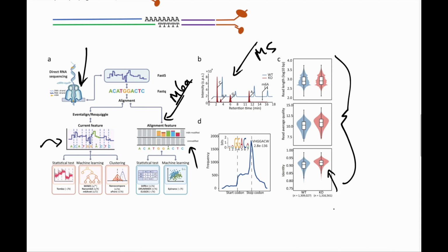m6a modifications being easier to read, or having basically less confounding squiggles, which corresponds to the sort of hypothesis that the m6a modifications confound the electrical current and make it more difficult to perform alignment, per this hypothesis that m6a can be detected through errors within the actual downstream processing.